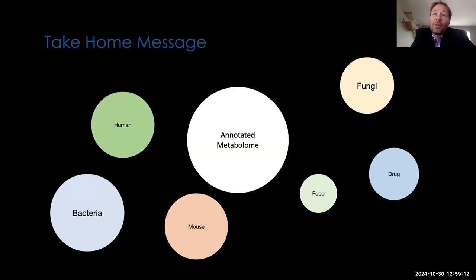So I think molecular networking is one way that you can begin to propagate. I think there are some other creative ways where people can assess metabolism, but those have just not been employed yet. So if anybody is interested in developing those resources, I would love to work with them.